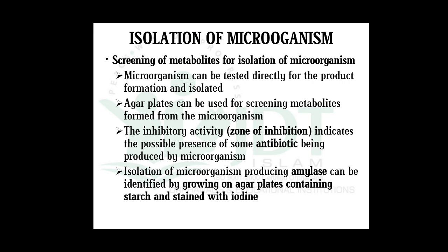So we are using a solid culture media. Into that we are inoculating a microorganism and allowing it to grow for some time. So after the growth of that microorganism, if that solid plate shows some zone of inhibition, it indicates that the microorganism can produce antibiotic-like substances in the culture media that we provided. So that is the screening method.